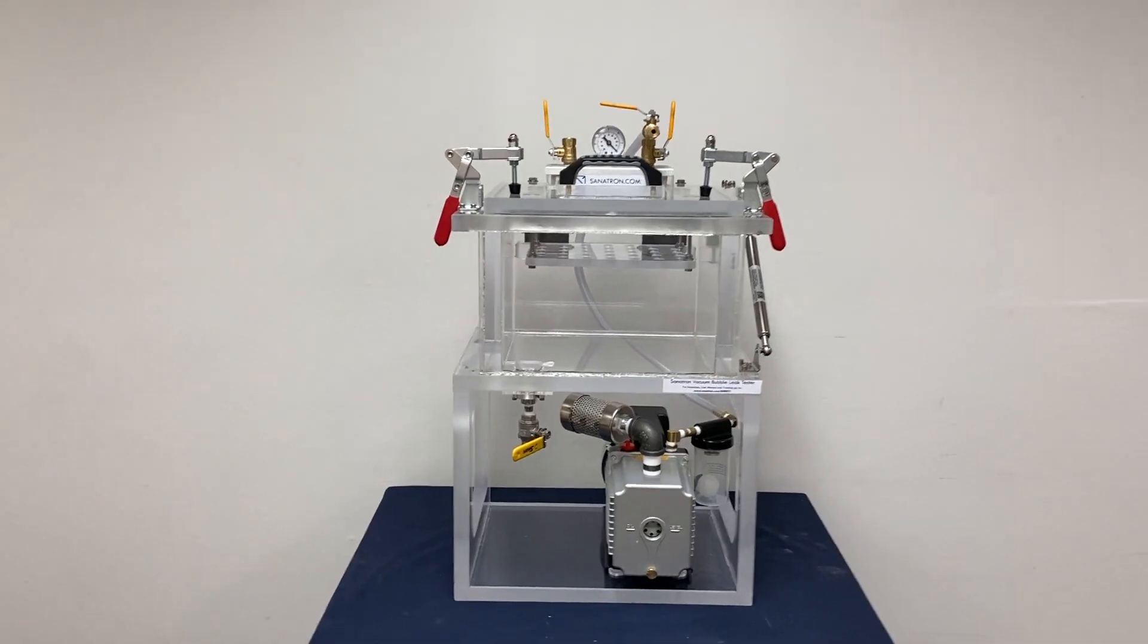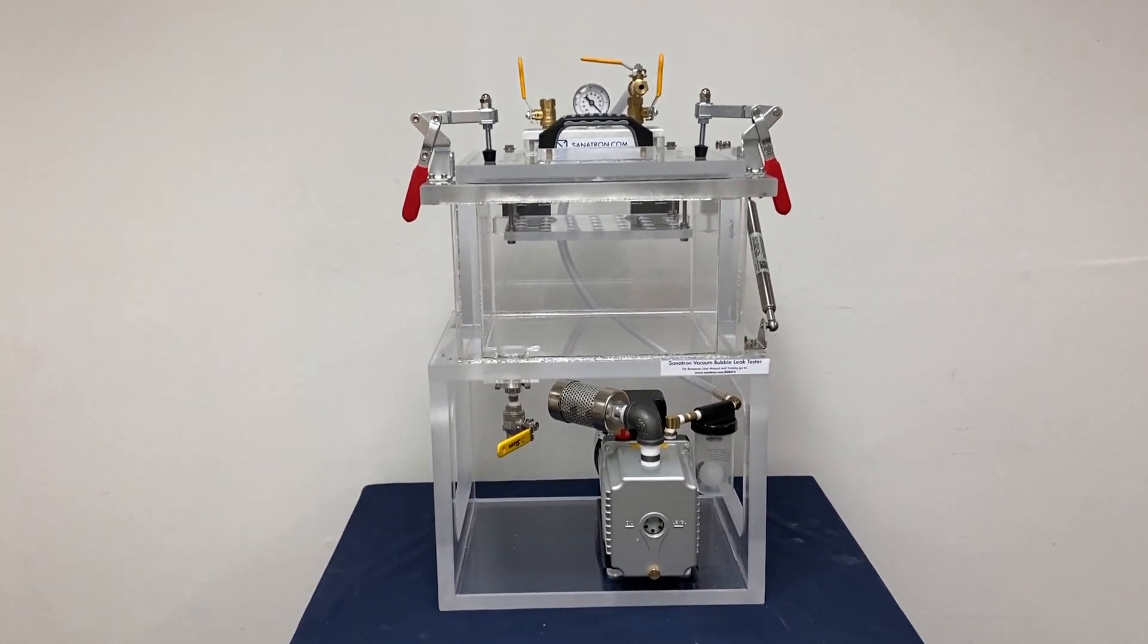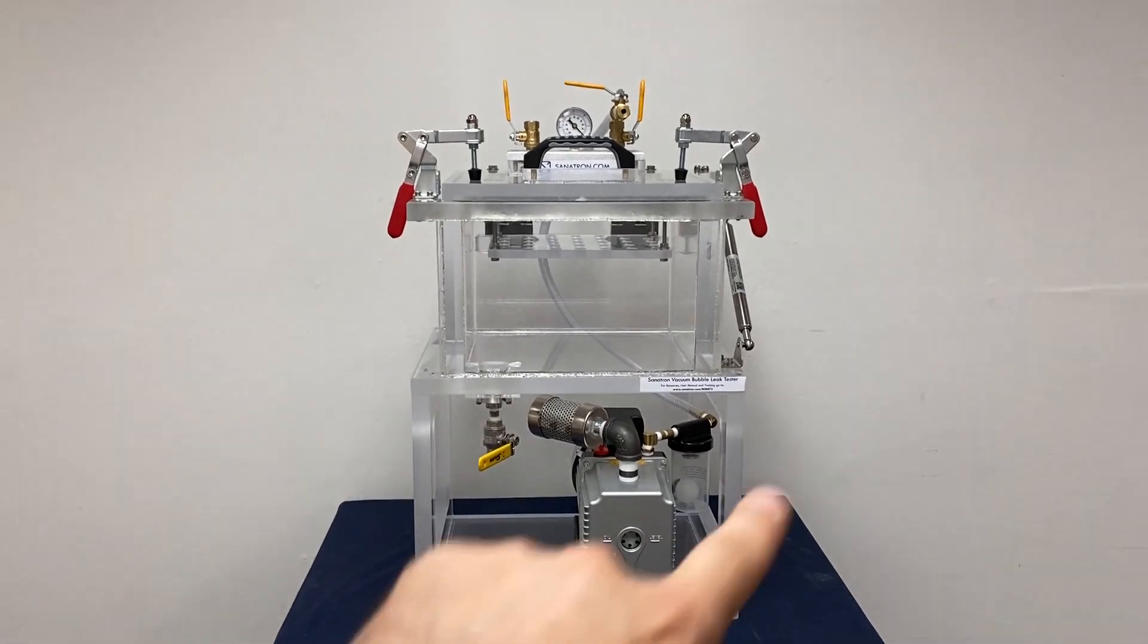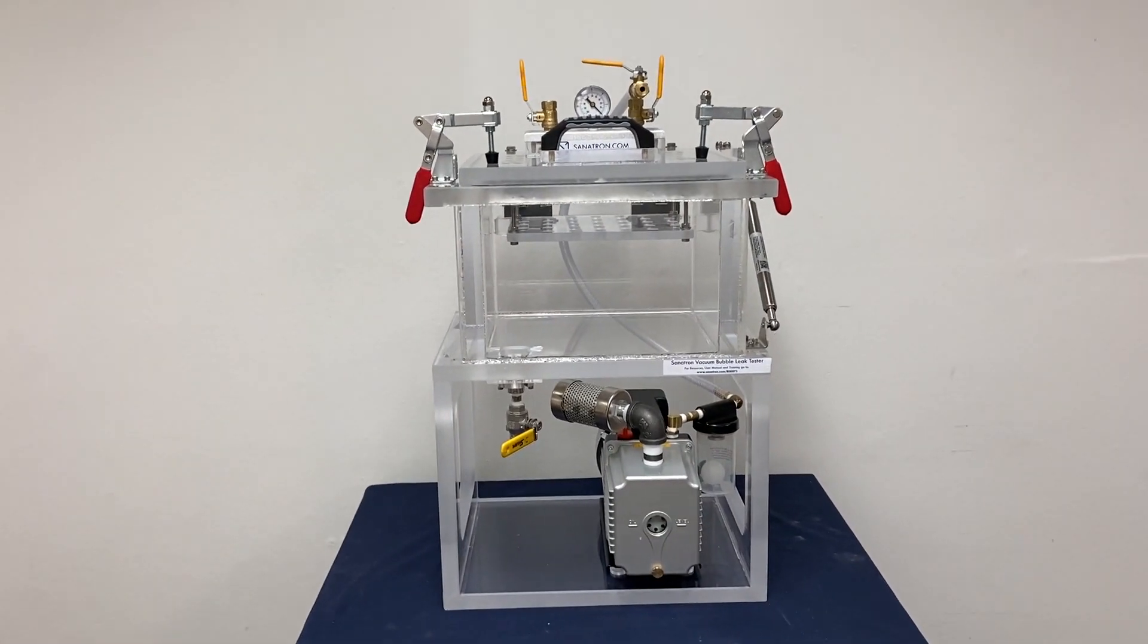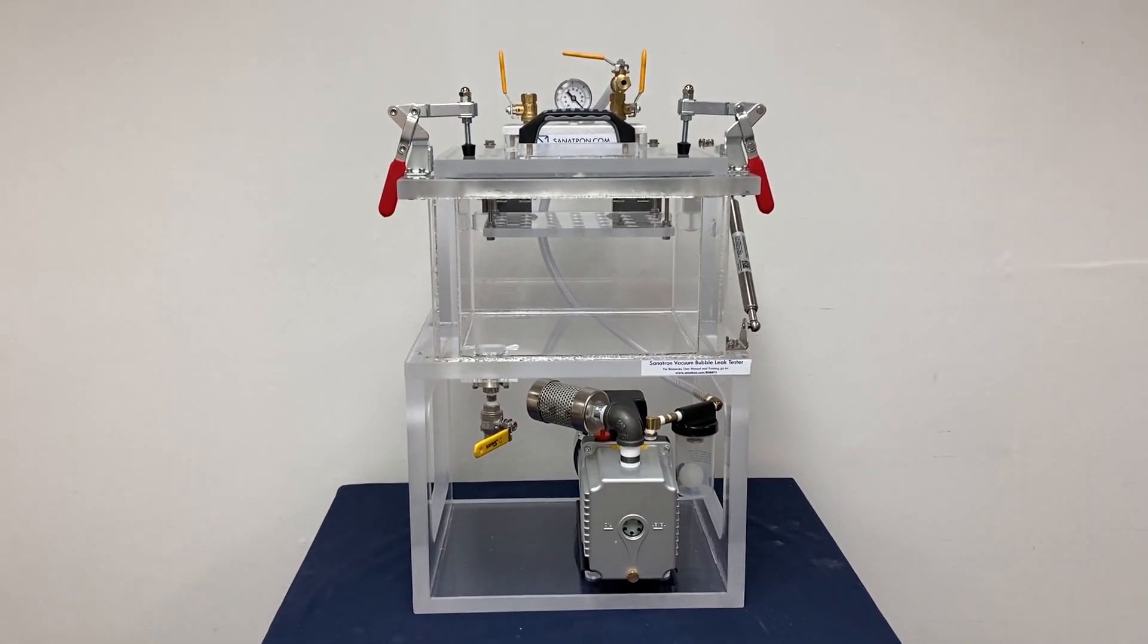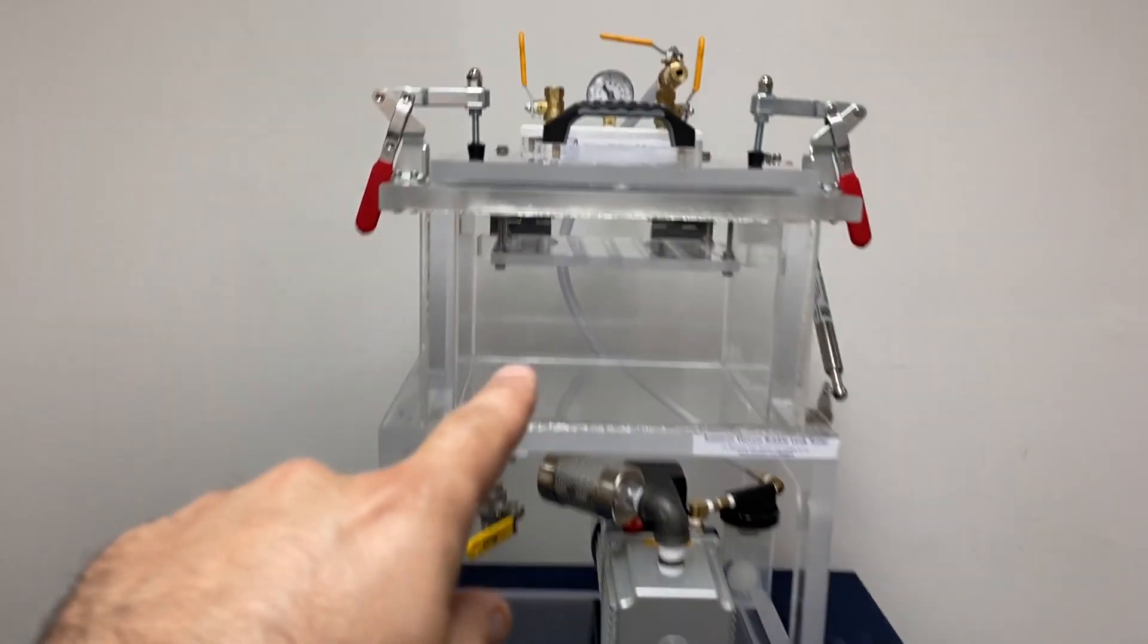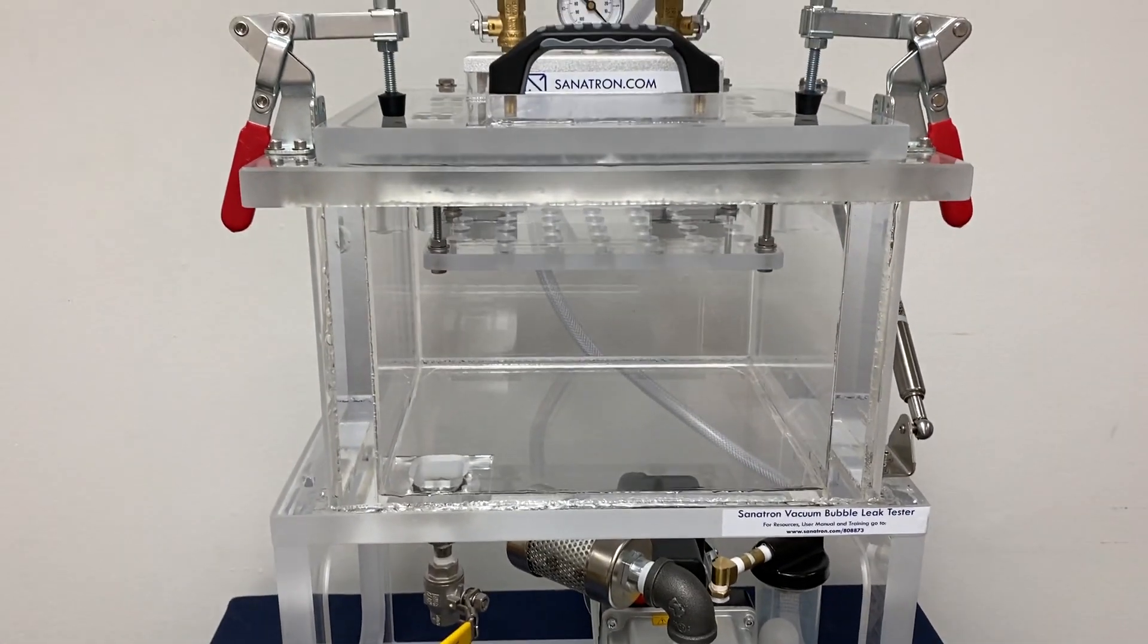Let's start talking about our system. This is a fully assembled and ready to go system. It consists of a vacuum chamber, a vacuum pump, and a full structure. This particular unit is a tabletop unit intended to be placed on a tabletop, and it is about chest high where you can look for bubbles and bubble emissions.